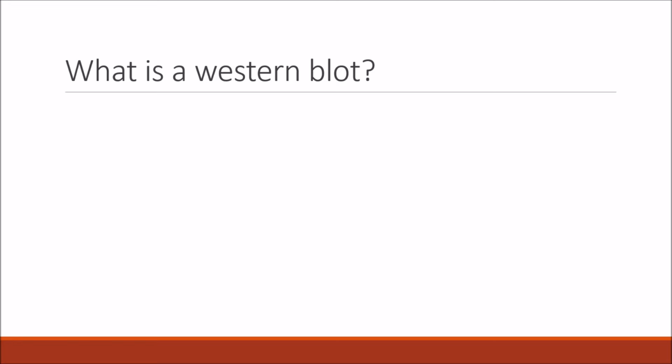So to start off with, what is a Western blot? Essentially, we are blotting proteins onto a nitrocellulose membrane to be read on a reader to see whether our protein of interest is there in our sample.